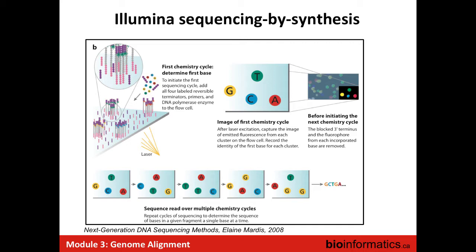You will start, so the first read will be with the purple one, so complementary. Before the first read, it brings the complementary adapter of the purple one, and then all the molecules with the purple on top will start to sequence, because the adapter is available and the complementary arrives, and then we measure. Then at the end of read one, after a given number of cycles, 100, everything is wiped, and then it brings the complementary of the pink one. All the molecules that have the pink one on top will start to sequence, and you will have the second read. Okay, that's very obvious, thanks. And that's why your two reads will be on different strands.